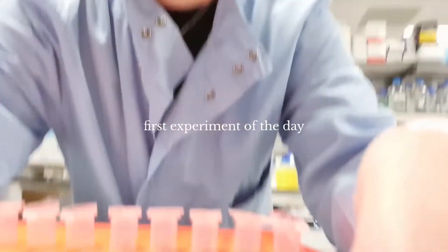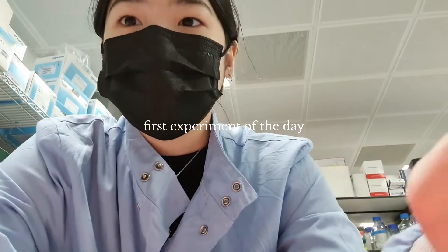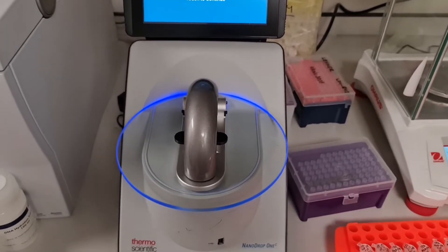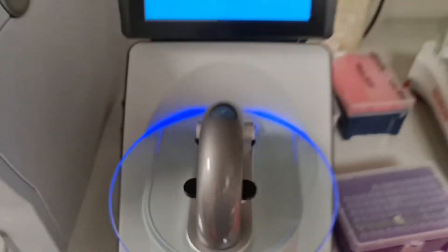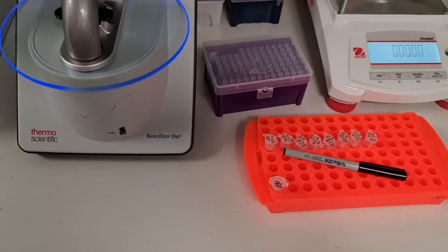Here I've got my DNA that I precipitated yesterday, which was left in the incubator to re-suspend. Now I'm just going to take a nanodrop to check its concentration before I start my PCR reaction. This is the nanodrop machine — I essentially load my samples over there and it takes a measurement, so I'll need to clean it, load a blank, and go from there.